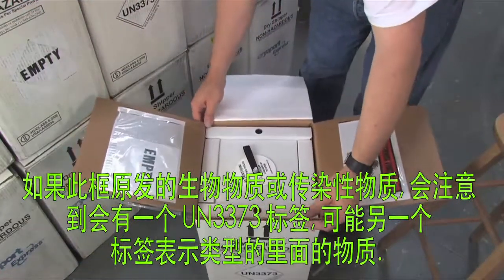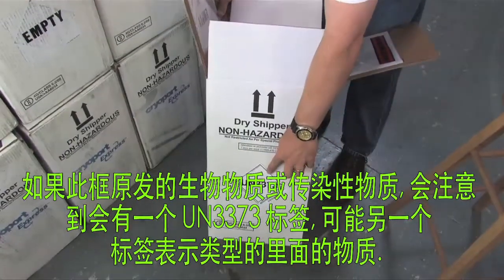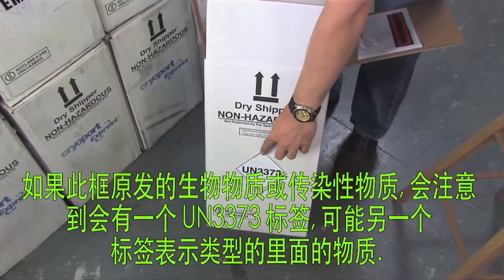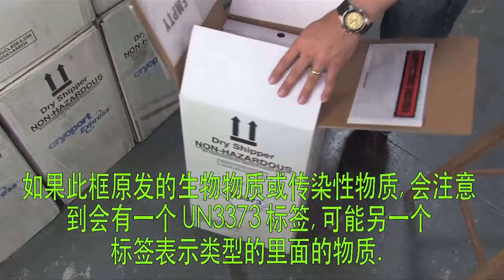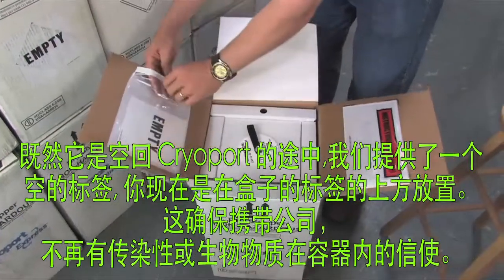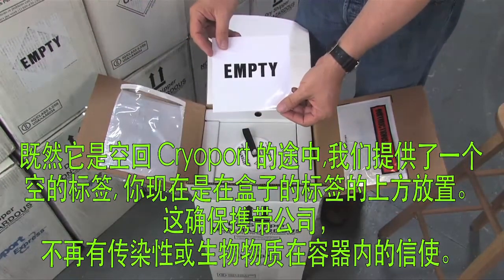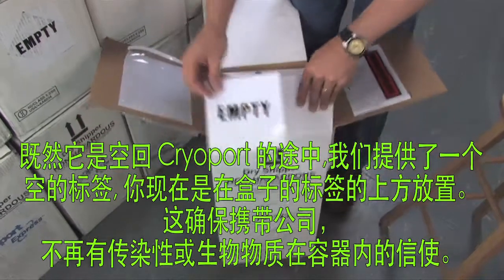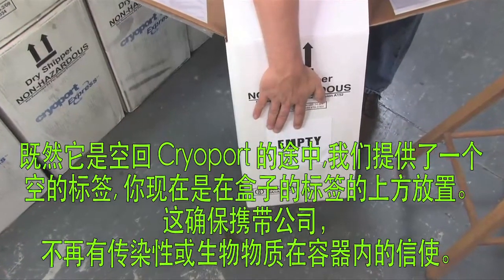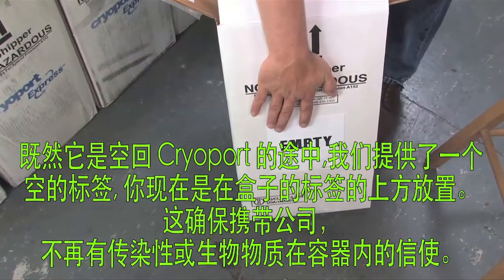If this box was originally shipping a biological substance or an infectious substance, you'll notice there would be a UN 3373 label or potentially another label denoting the type of substance inside. Since it is going to be empty on its way back to Cryoport, we have provided an empty label for you to place over the top of the label that is now on the box. This ensures that the carrier knows there are no longer any infectious or biological substances inside the container.